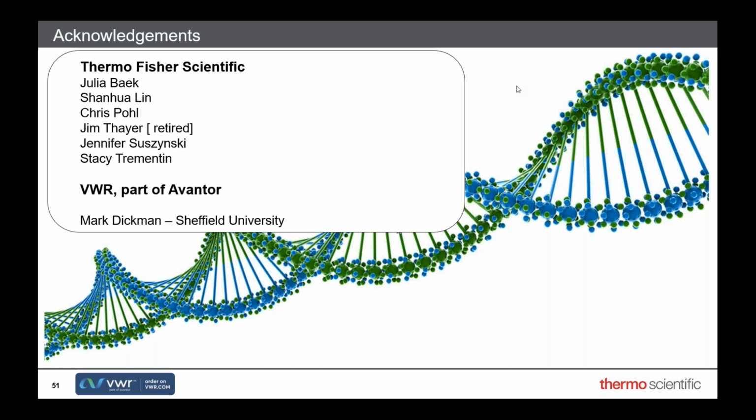I would look closely at the newer one Thermo Fisher have just brought out, and we're seeing things that you wouldn't even see in the noise. So we're well below the 1%, 0.1% level for an impurity. But it's not just the column separation and what mass spec you're using. The Orbitraps are sensitive, and the software is going to make a difference as well. If you're looking at UV, again, you're well below the 1% level and down into the 0.1s for impurities.